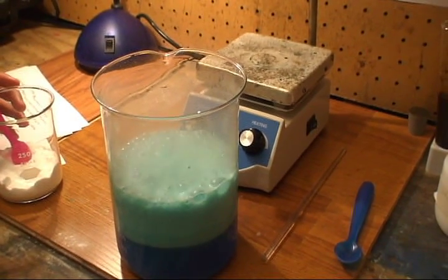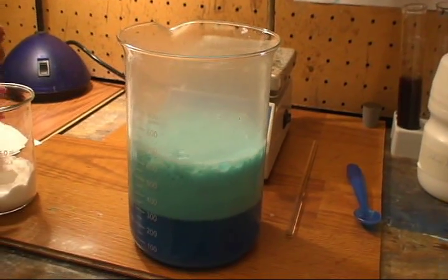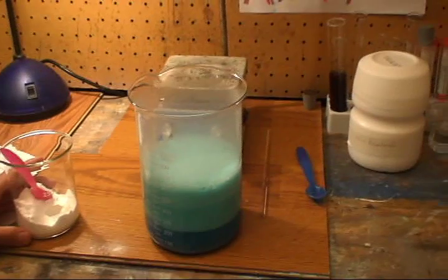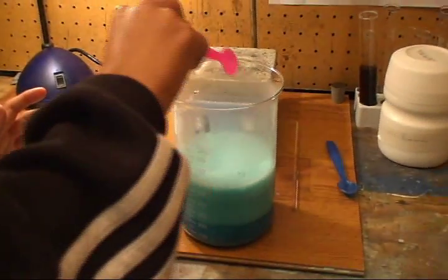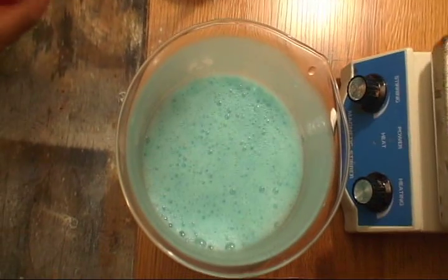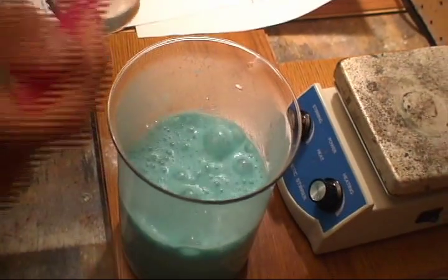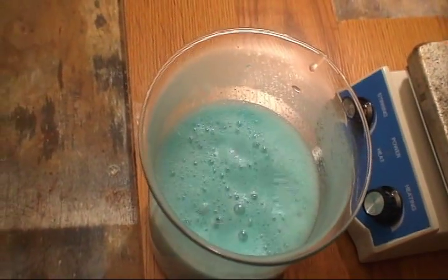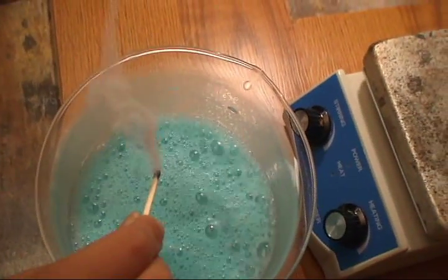Take a look at that — as you can see, we're putting baking soda into the copper sulfate solution. We can prove that this is carbon dioxide being produced because when you light a match over it, it automatically goes out.